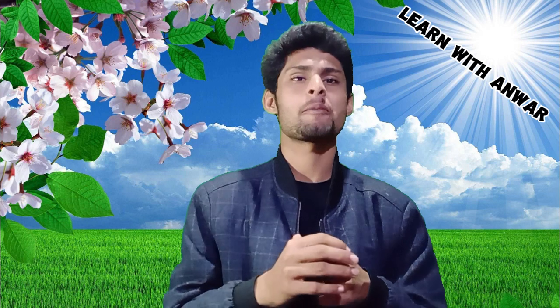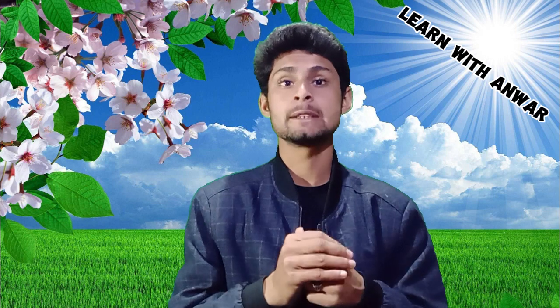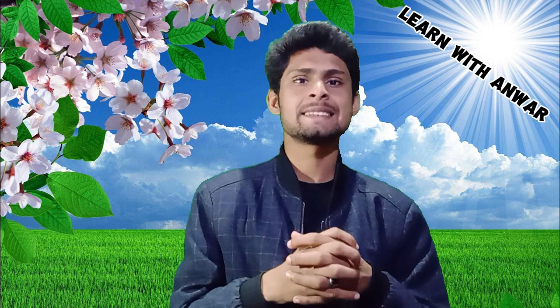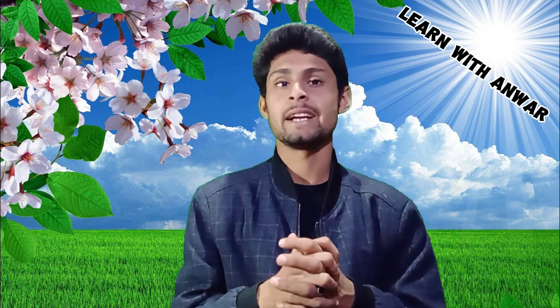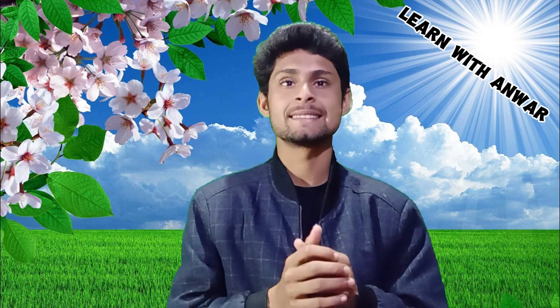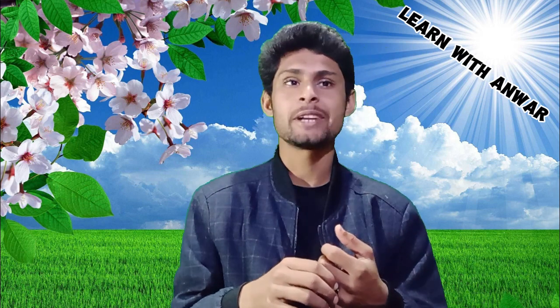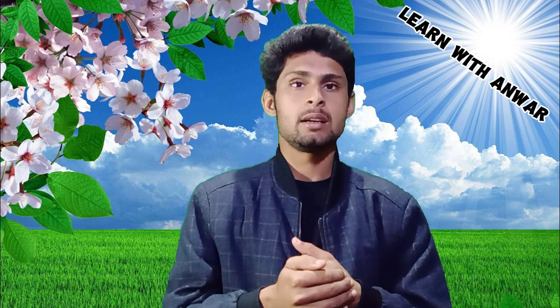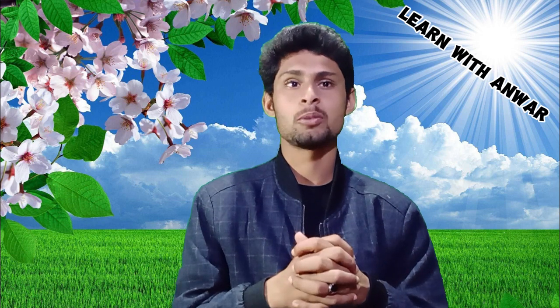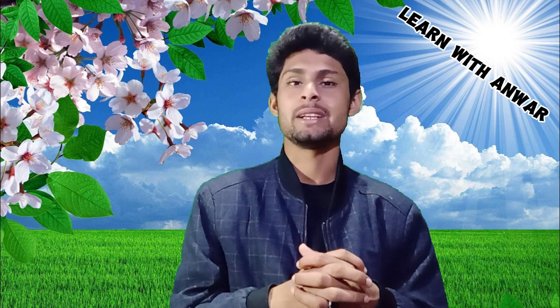The magnifying power of a microscope is an expression of the number of times the object being examined appears to be enlarged, and it is a dimensionless ratio. It is usually expressed in the form of 10×, meaning an image magnified tenfold, sometimes wrongly spoken as 10x, as though the x were an algebraic symbol rather than the correct form, 10 times. The resolution of a microscope is a measure of the smallest detail of an object that can be observed. Resolution is expressed in a linear unit, usually micrometers.